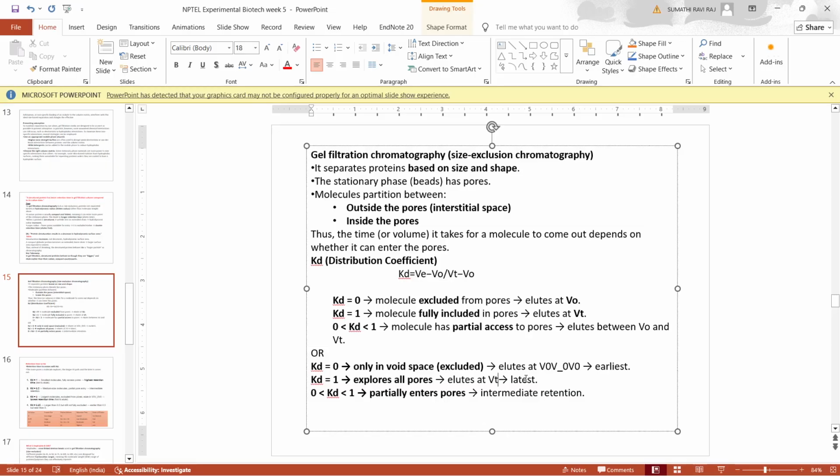You can do either protein estimation, or you can run your gel with the different volumes which you have collected. You can run it in your gel, stain your gel, and check the particular molecular size of your protein. Or if you want something very specific, like beta actin only, then you can further continue to Western blot and add your beta actin antibody and check whether it has come in your volume or not.